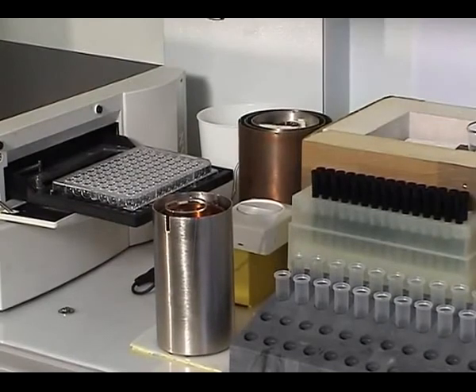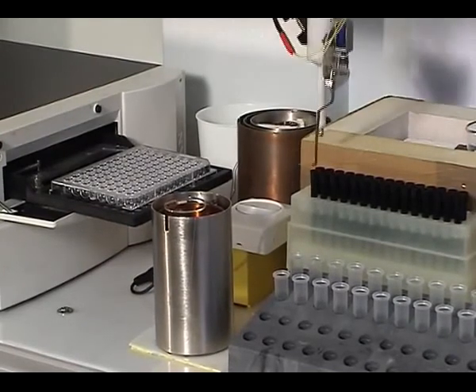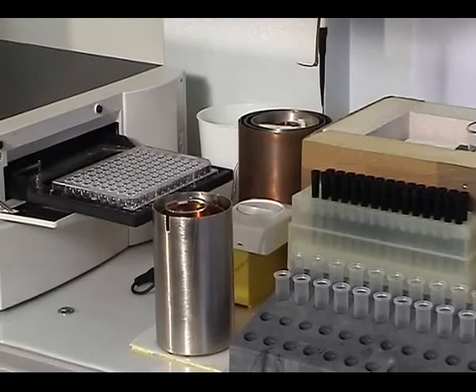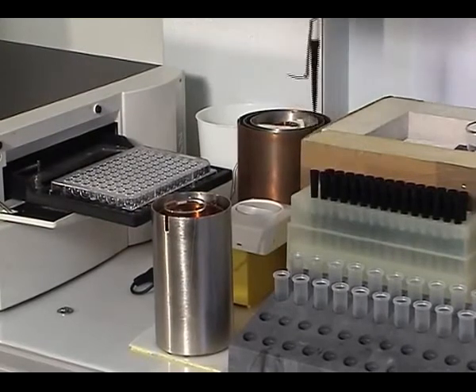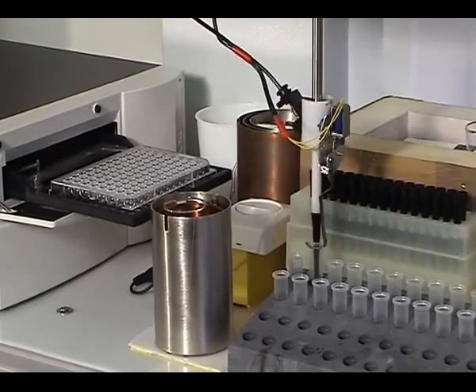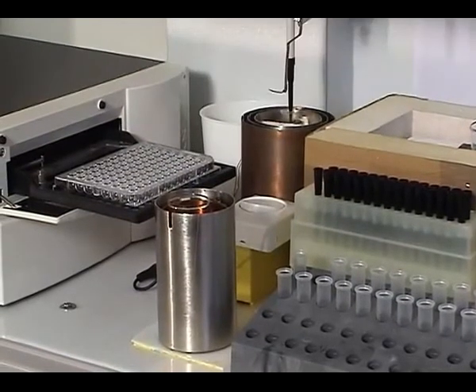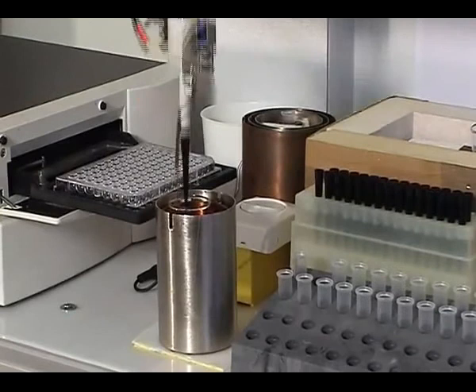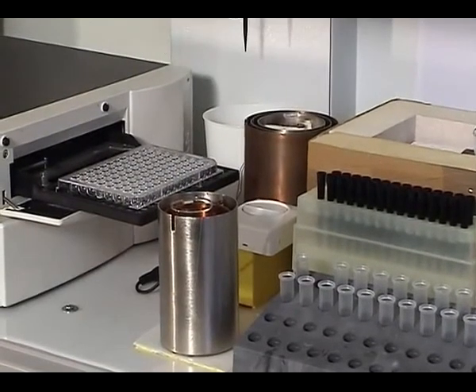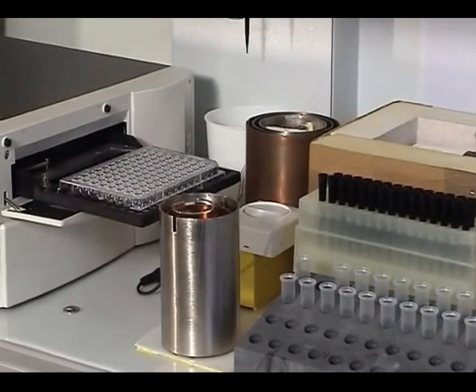Then it will collect the second tube and do exactly the same. Water is being dispensed into the tube. Five minutes, another signal.